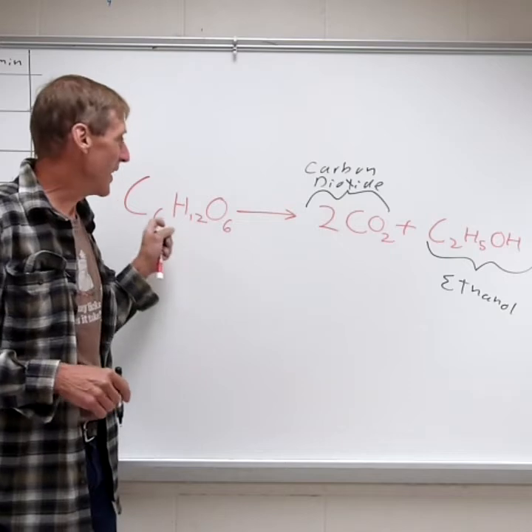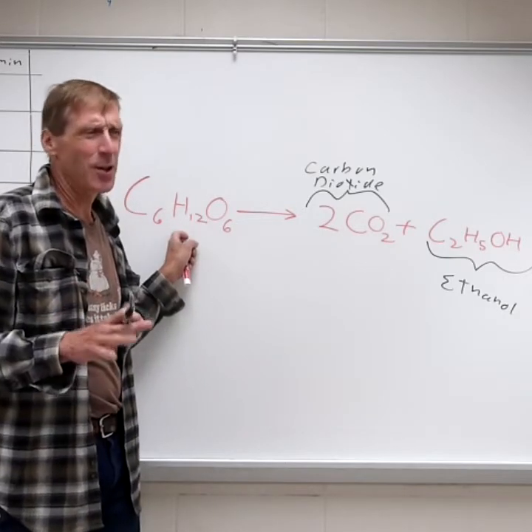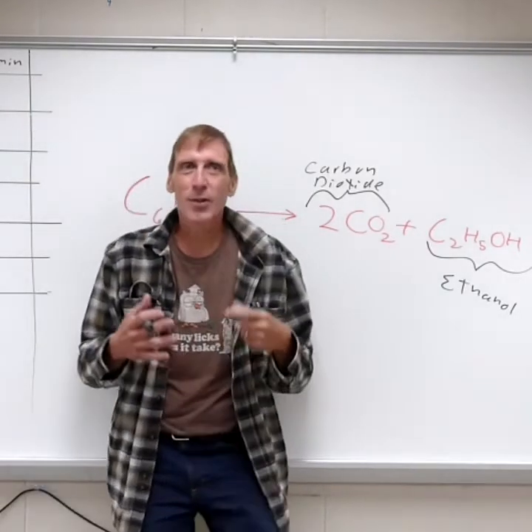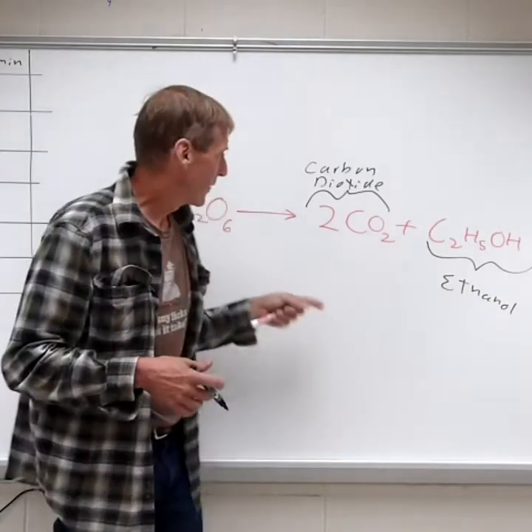Now today, we're going to be taking these yeasts, we're going to be feeding them a carbohydrate source. It's sucrose, not glucose, but fundamentally it'll work the same way. And we're going to monitor a few variables that might affect how fast fermentation occurs.